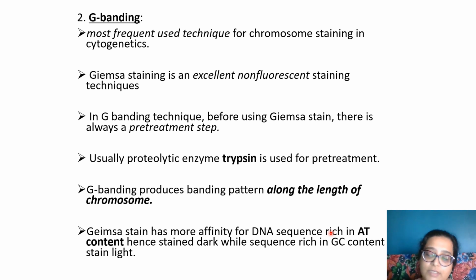Today I just wanted to sensitize you about what a karyogram is, types of karyograms, symmetric, asymmetric, the basics of how to stain, and what to look at in the bands, and why we do karyotyping. In the next lecture I'll tell you the stains which we use in karyotyping, and after that I'll show you some examples and cases for this.